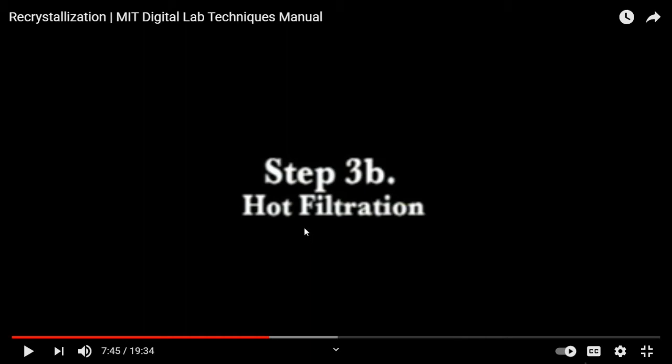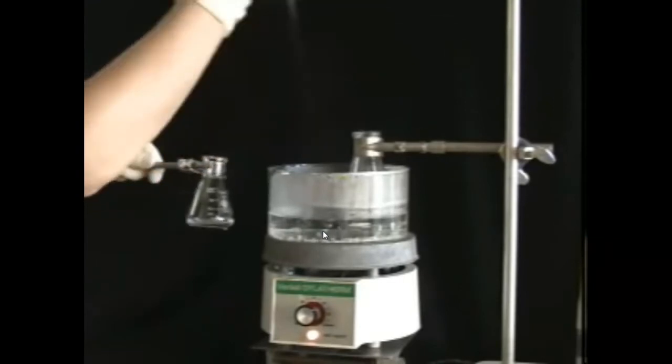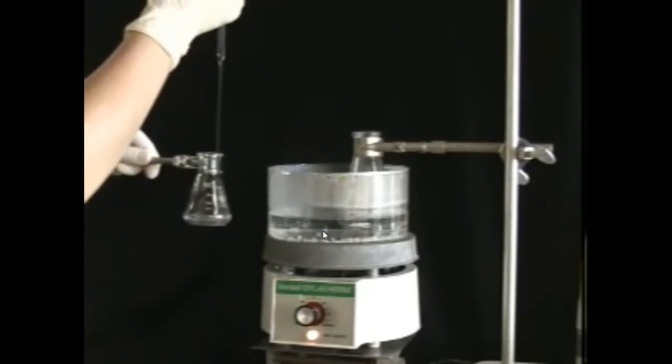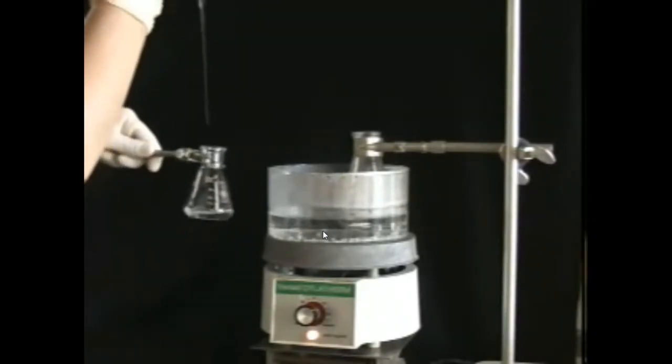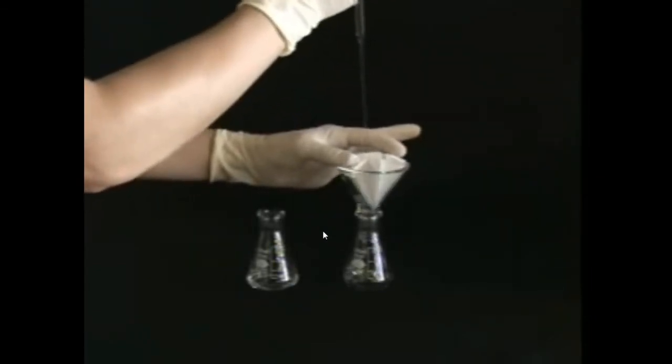Otherwise, we are going to lose our main compound because it's going to solidify. It's going to be filtered off along with the charcoal. You have to keep the solution hot. Okay? Makes sense, I hope. Vacuum filtrations cool the solution too much and crystals are lost on the filter paper and funnel. Before filtering your solution, add some excess solvent and heat it to the boiling point to ensure that the compound stays dissolved during the filtration. Wet the filter paper with some hot solvent and filter the solution.